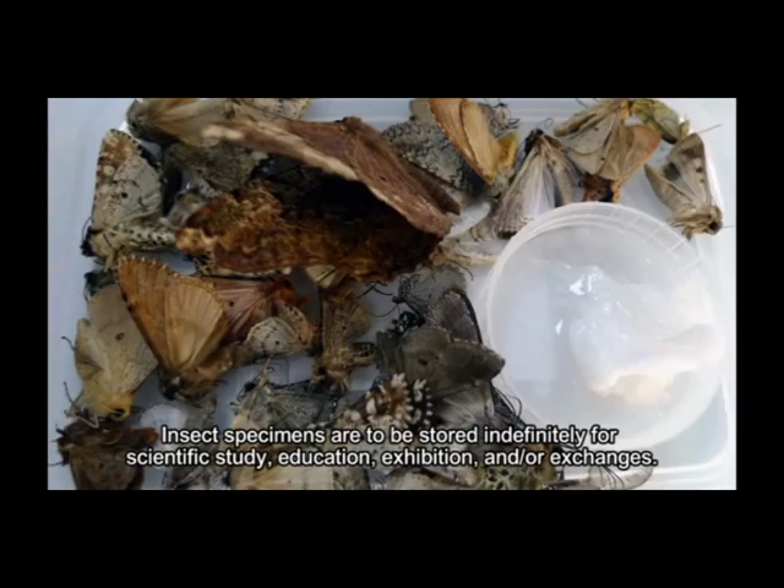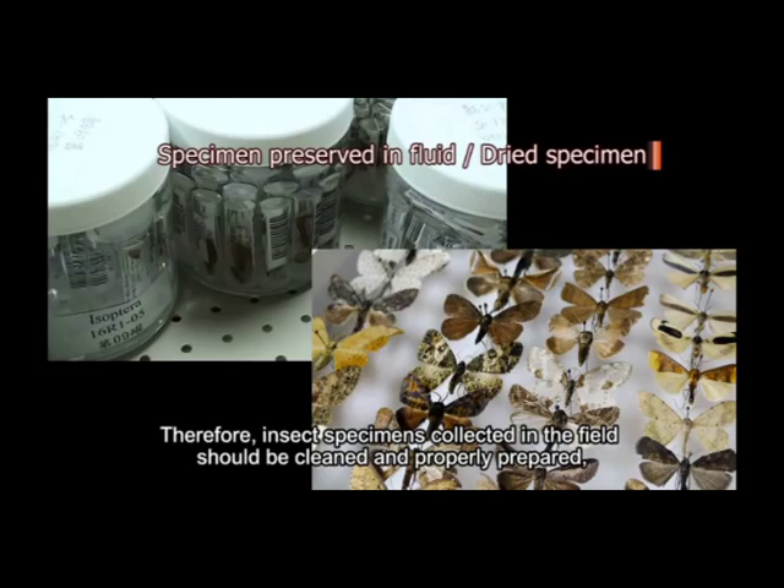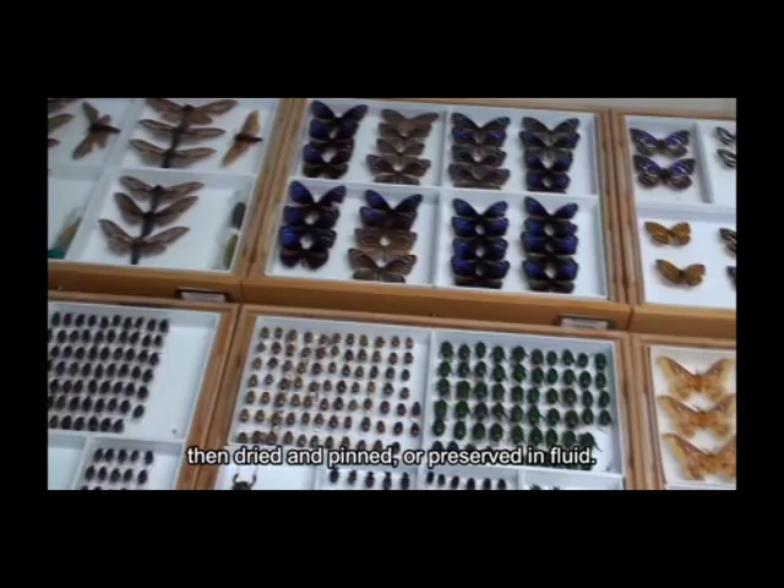Insect specimens are to be stored indefinitely for scientific study, education, exhibition, and/or exchanges. Therefore, insect specimens collected in the field should be cleaned and properly prepared, then dried and pinned, or preserved in fluid.